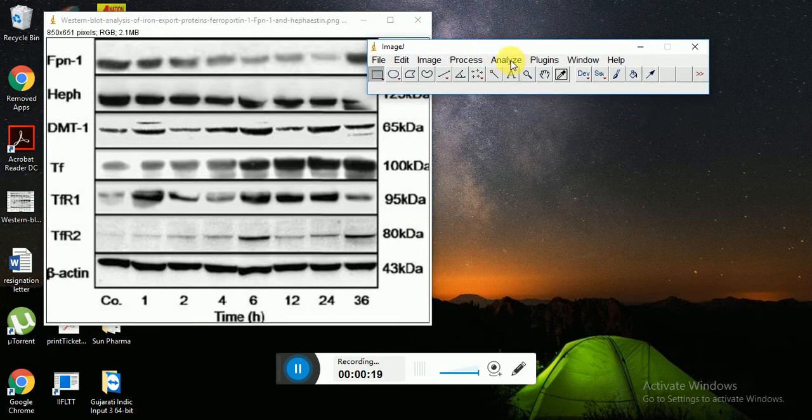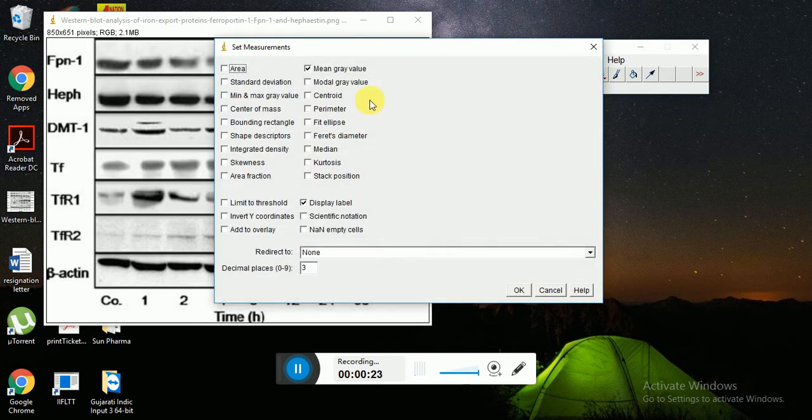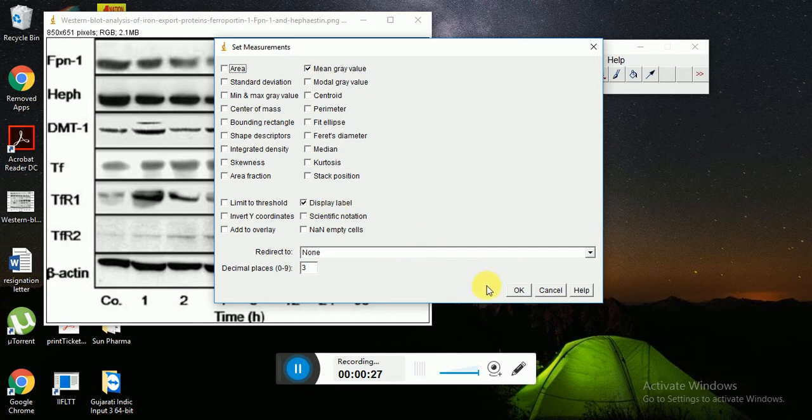Then just set the measurement. Here you have to select mean gray value and display label, then press OK button.